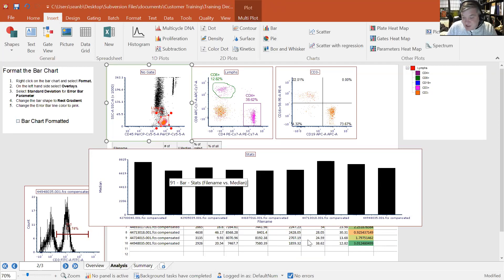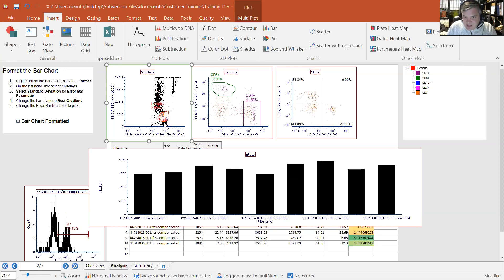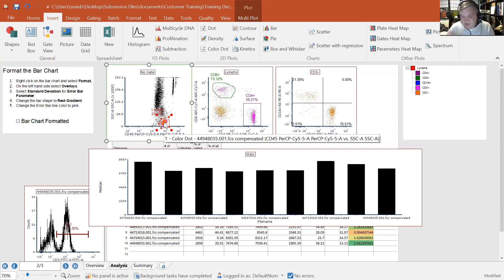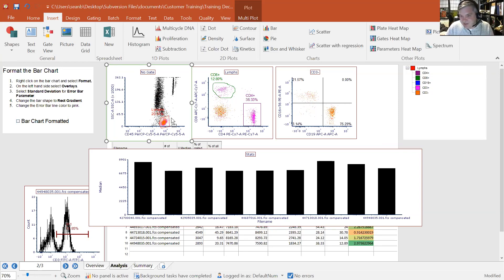To insert a bar chart, select the spreadsheet, go to the Insert tab, and choose Bar. When you draw the object, a bar chart is inserted with file names on the x-axis and all available parameters on the y-axis to pick from. Since bar charts are based on spreadsheets, which are based on the data, as you move a gate everything in those bar charts updates — you can review changes in real time without going back to Excel or Prism.